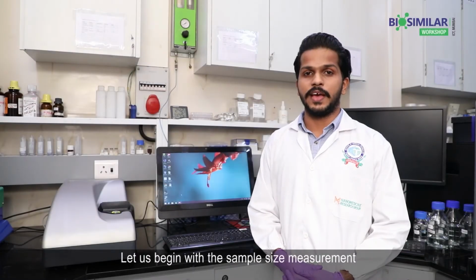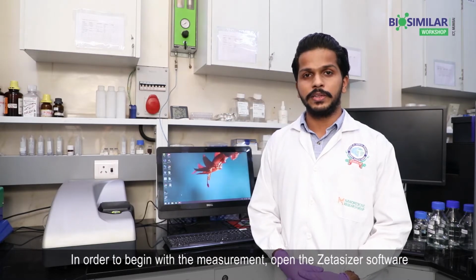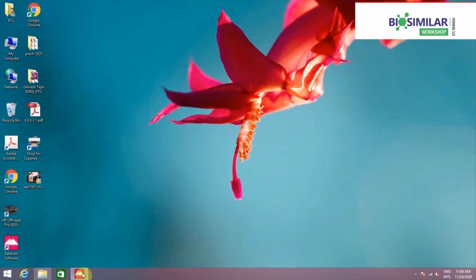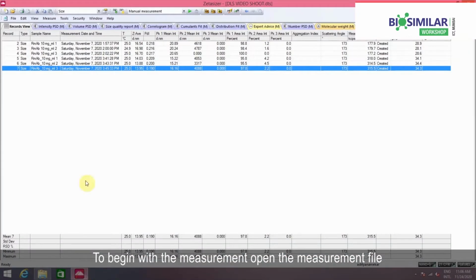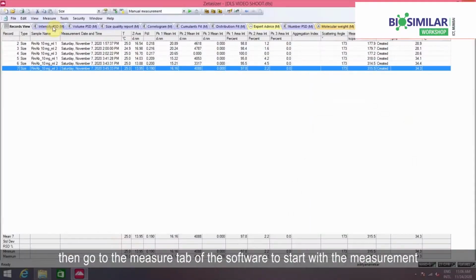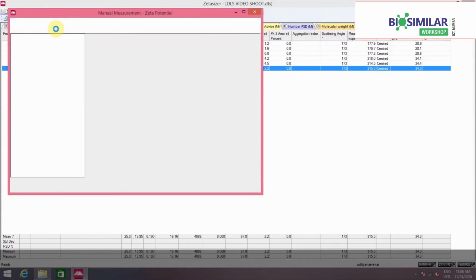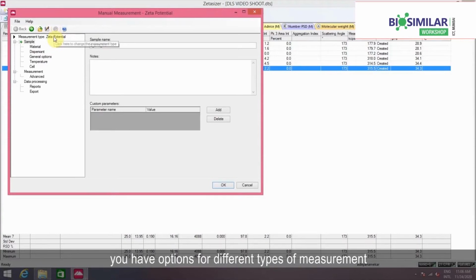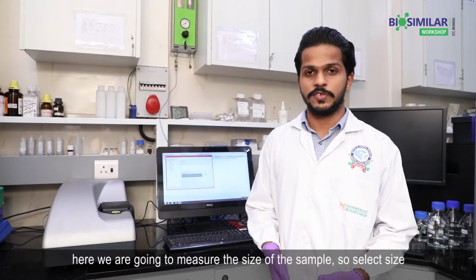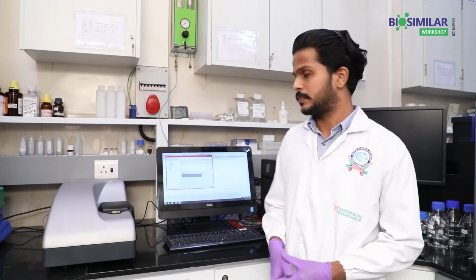Let us begin with the sample size measurement. In order to begin with the measurement, open the Zetasizer software. To begin with the measurement, open the measurement file. Then go to the Measure tab of the software to start with the measurement. Under the Measure tab, you have options for different types of measurement. Here we are going to measure the size of the sample, so select size and enter an appropriate name for the sample.